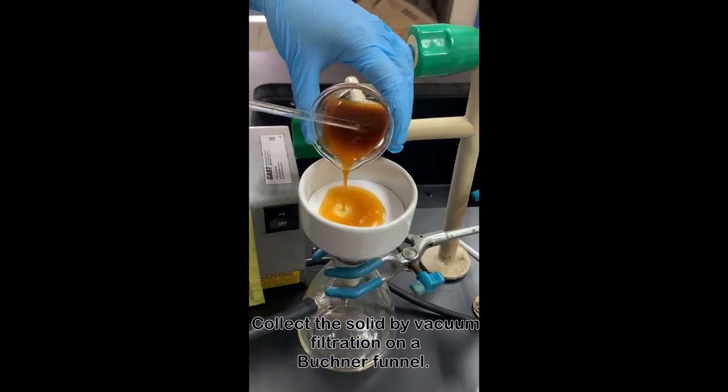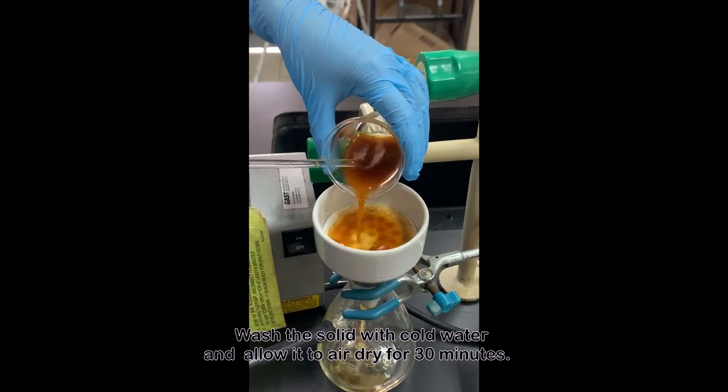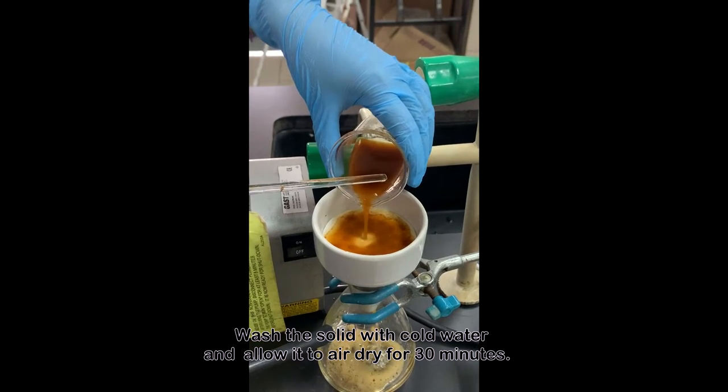Collect the solid by vacuum filtration on a Buchner funnel. Wash the solid with cold water and allow it to air dry for 30 minutes.